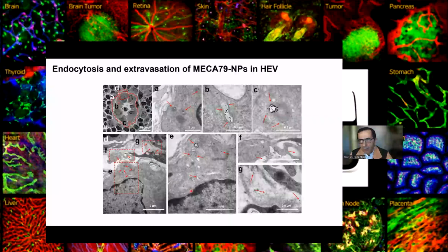And I don't know whether you're able to look at the subcellular level. Probably not, because the resolution is not that high. But one of the questions I always have is that when you get the nanoparticle and you do targeting, you put antibody, etc., I don't know if anyone has been able to show live images of this particle sticking to the endothelial cells, because that's the first layer they need to pass through.